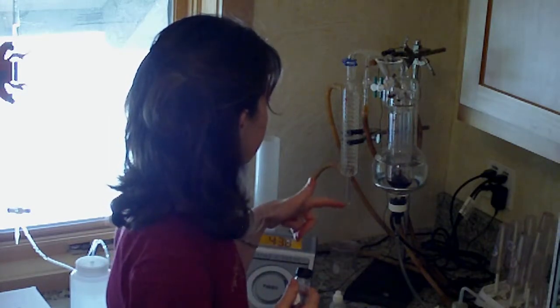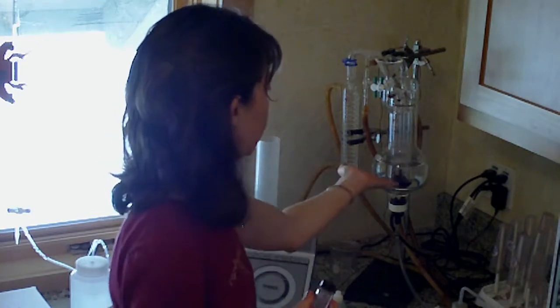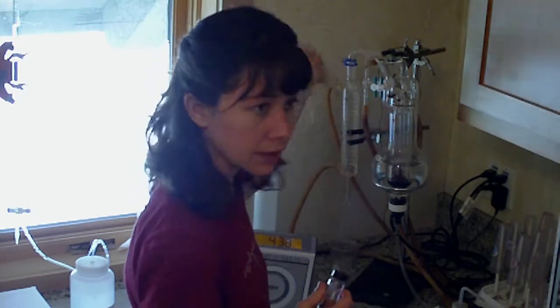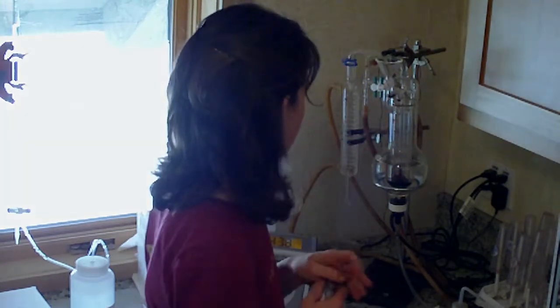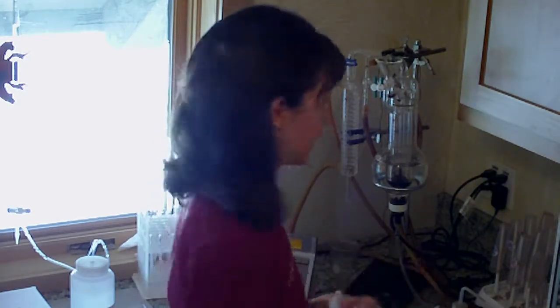So it's just a distillation process. The chamber gets really hot, and the distillate evaporates and then condenses and comes out as a clear liquid, but the bacteria is in there, and it smells really gross, and it tastes like dirty water.